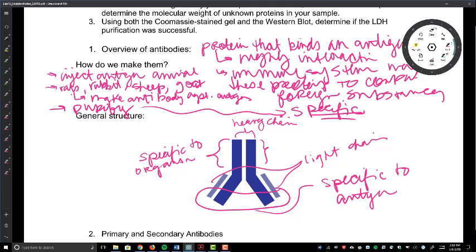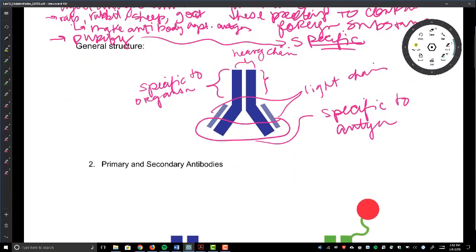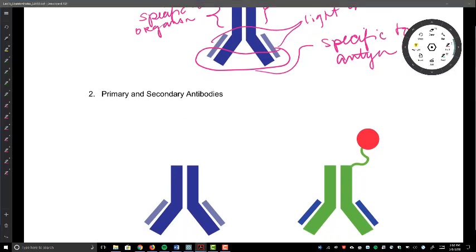So when we use antibodies in the lab, we use a scheme where we mix what are called primary and secondary antibodies to allow us to detect a particular antigen. This is a general scheme that is exploited for different systems, but I'm going to talk mainly about the system that we use.